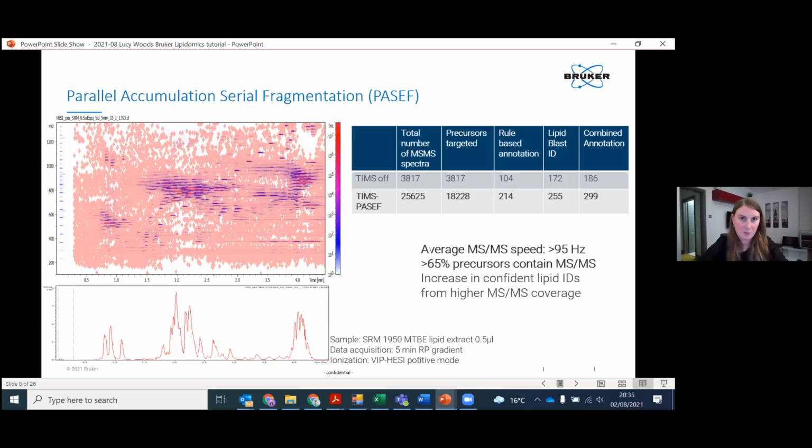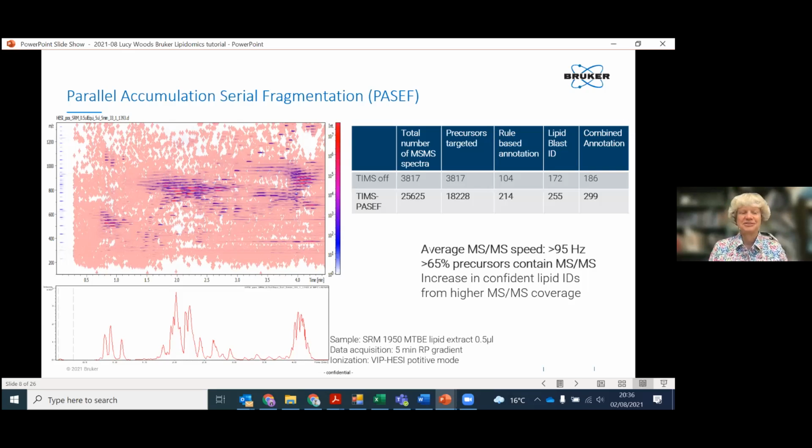So we typically do TMT 6-plex and not higher, because the mass difference is sufficient to be resolved on the platform. I think you can also use the 16-plex, but it's not a full 16-plex experiment. You resolve about half of them and leave out a few of the tags. Yeah, great, thank you.